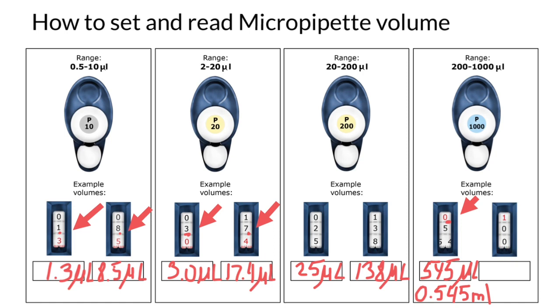And the last number, we do not read as 100 microliters, again, because range is between 200 and 1000, but instead, this is 1000 microliters. But why is the first digit red and the rest are black? Because again, we also can put a decimal point between these digits, and we also can say that instead of 1000 microliters, we have here one milliliter, because 1000 microliters equal one milliliter.